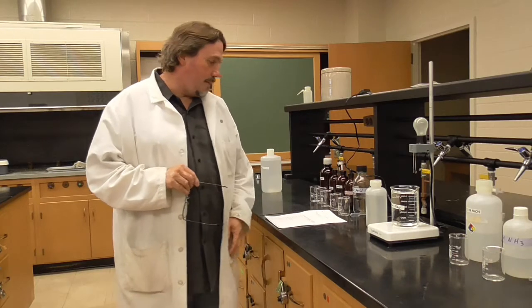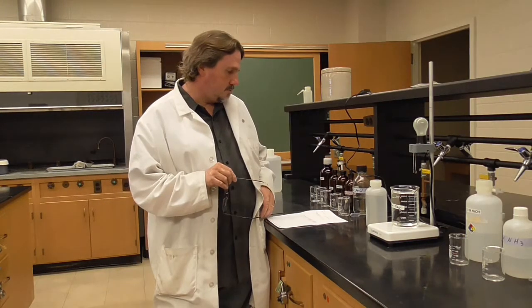The dialysis and osmosis lab, part A. Part A is all about electrolyte demonstration, which refers to the ability of a compound when dissolved in water to conduct electricity.